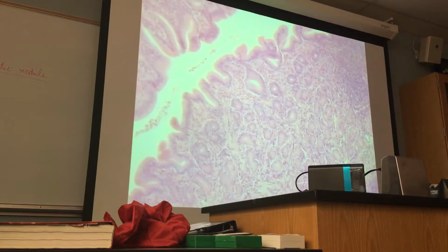So is this. So if you make a section, it will appear like this. This is the lumen of the stomach. Okay? If there is a pointer, identify the structure or the feature, gastric pit. Which part did you say would be the lumen when you go lower down into it? This is the gastric gland. Gastric pit is from here to here. And this is the opening of the gastric pit. Okay?